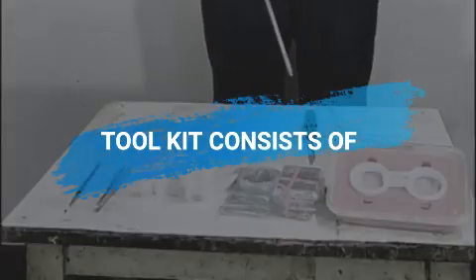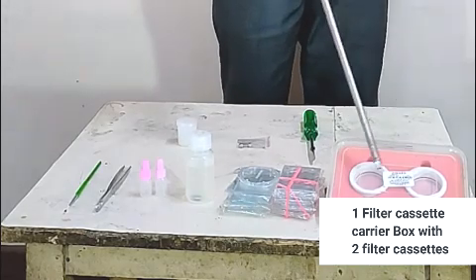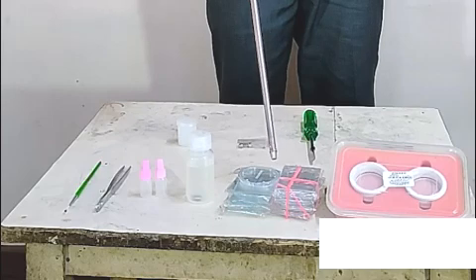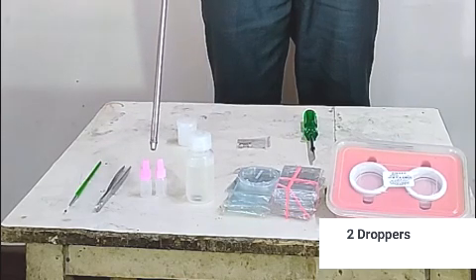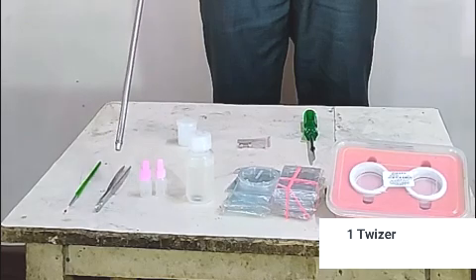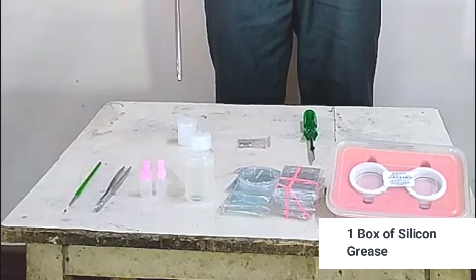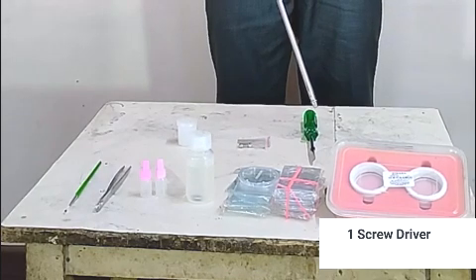The tool kit consists of 1 filter cassette carrier box with 2 filter cassettes, 10 filter carriers with cover, 50 milliliters silicone oil, 2 droppers, 1 tweezer, 1 cleaning brush, 1 box of silicone grease, 2 fuses, and 1 screwdriver.